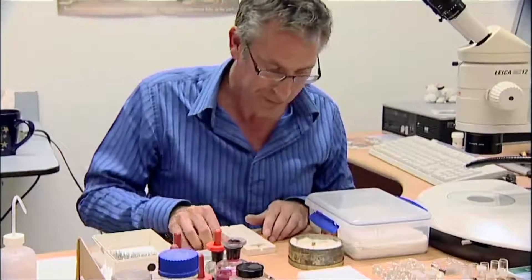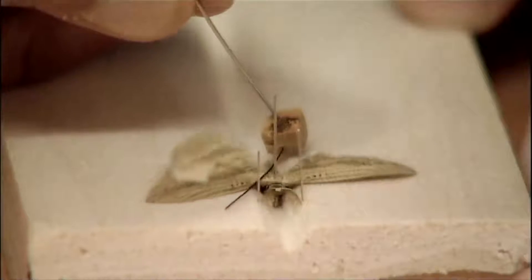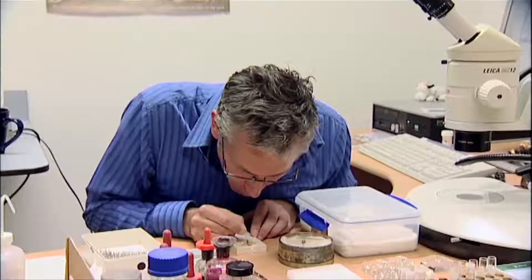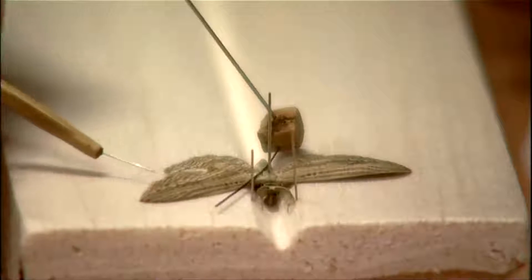Now this is where I get my little setting bristle, which is made from a little piece of cork through which I have pinned a big entomological pin. The bristle — the best thing is a cat's whisker, or some people say a lion's whisker. But you can also use a little nylon bristle from a clothes brush.